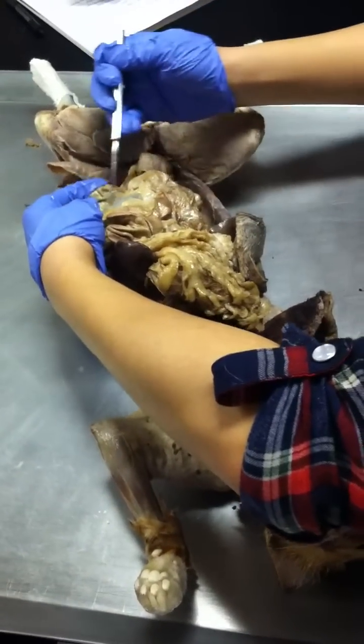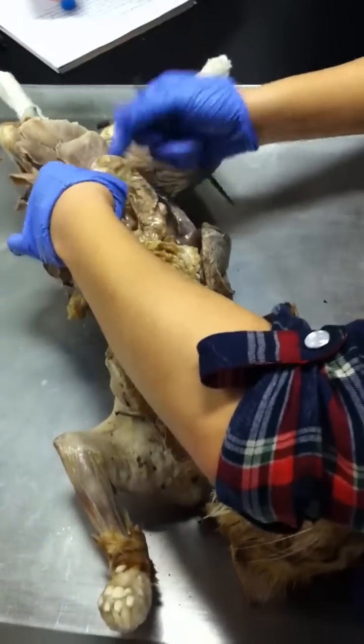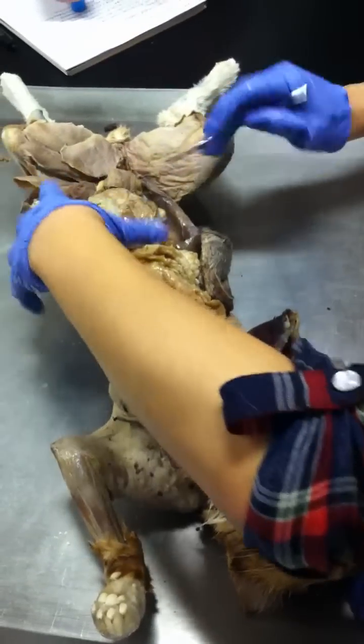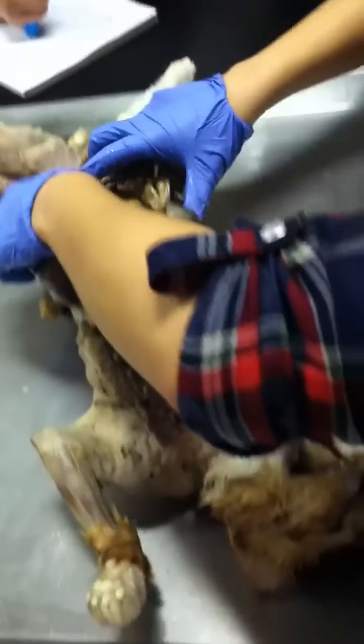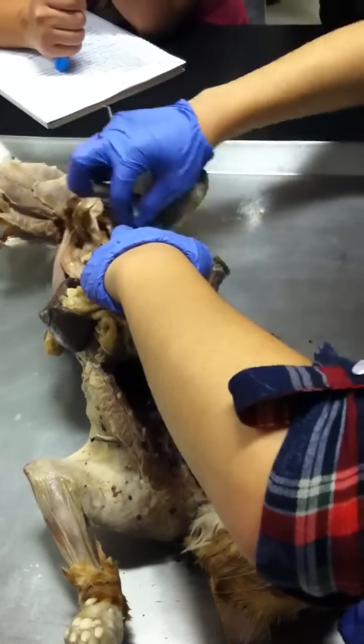Okay. But this structure right here is the ileum. Right? Ileum. If I pin this, this is the ileum. But the cecum is the little bulge that comes out, right? Okay. Bulge that comes out. Excellent, right? So duodenum, jejunum, ileum, and then we're going to go to the large intestines, right? The large intestines, remember it does a huge rainbow thing, right? Okay.